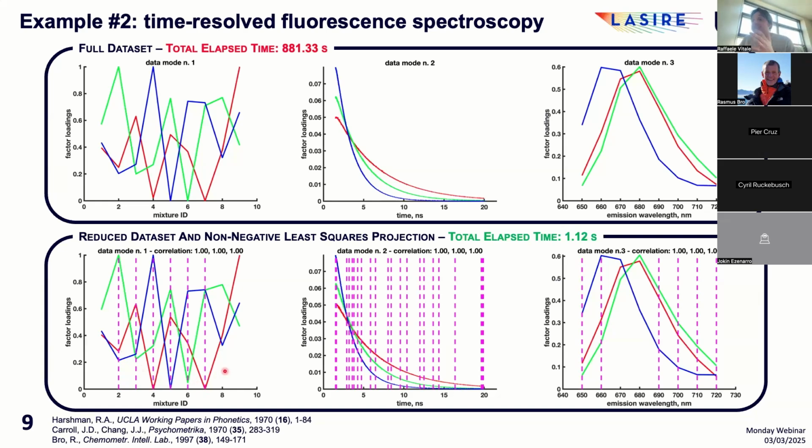This clearly evidences how the essential information-based selection procedure is actually capable of reducing the redundancy of the information encoded in the investigated data prior to their final decomposition. Emission wavelengths characterized also by a strong overlap among the 3 different ParaFac-ALS loadings profiles were satisfactorily identified as non-essential and therefore excluded from the compression operations.